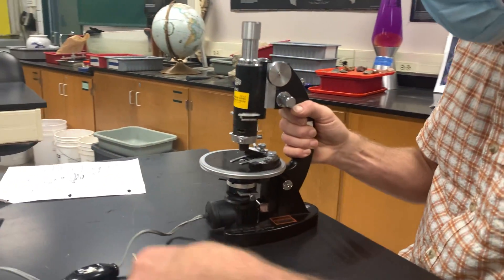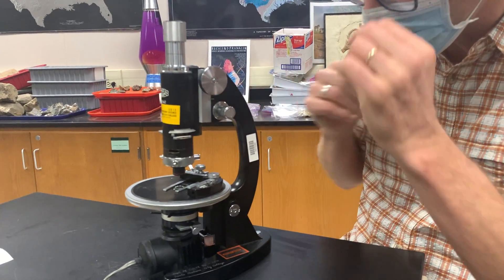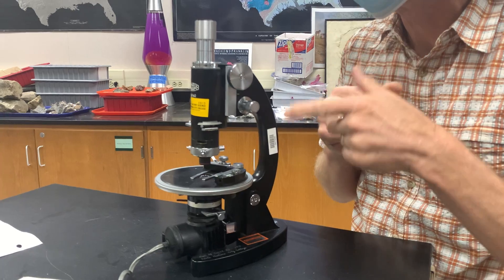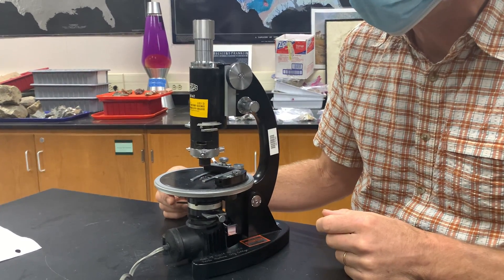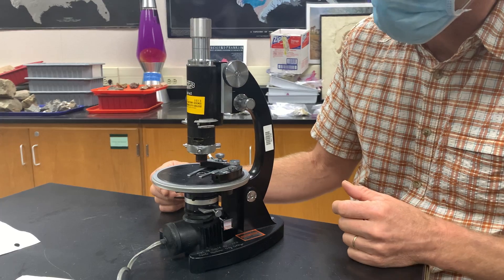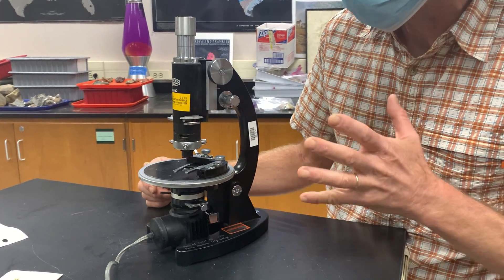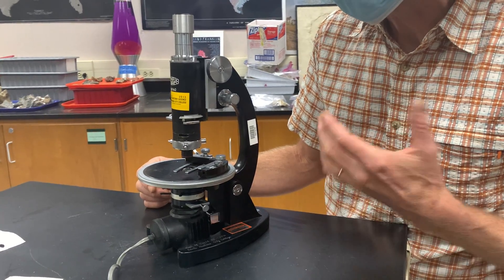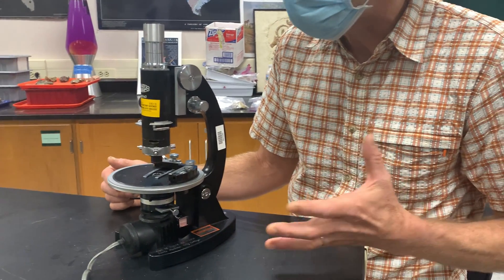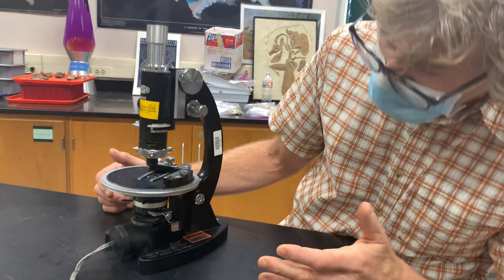These are beautiful microscopes, by the way. They're old — I don't know when they were made — but these are Olympus microscopes, which is a fabulous company for making microscopes. They still make microscopes and they make some of the best research-grade microscopes out there. The optics are excellent. So there's really nothing bad about this being an old microscope. So the way it works is this.